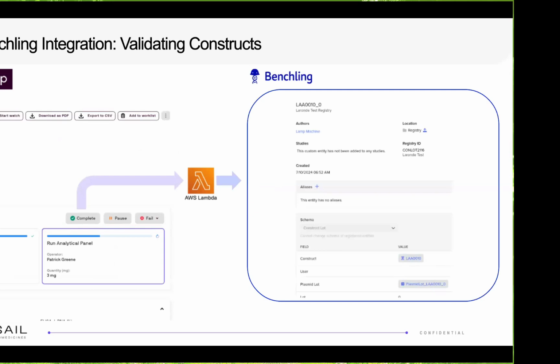So this is how we have our data primarily represented in a separate system, but we also make sure that Benchling is synchronized with what's going on in LAMP. As soon as the action is taken, we trigger the process that pushes things to Benchling. Of course, there are faults, there are things that don't work. Various kinds of failures can occur, and we'll come back to that later, as to some of these we might have wished we had done differently.